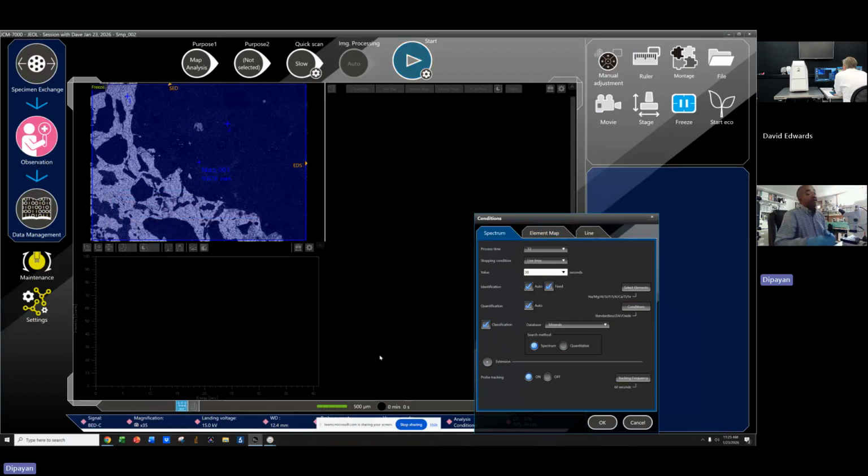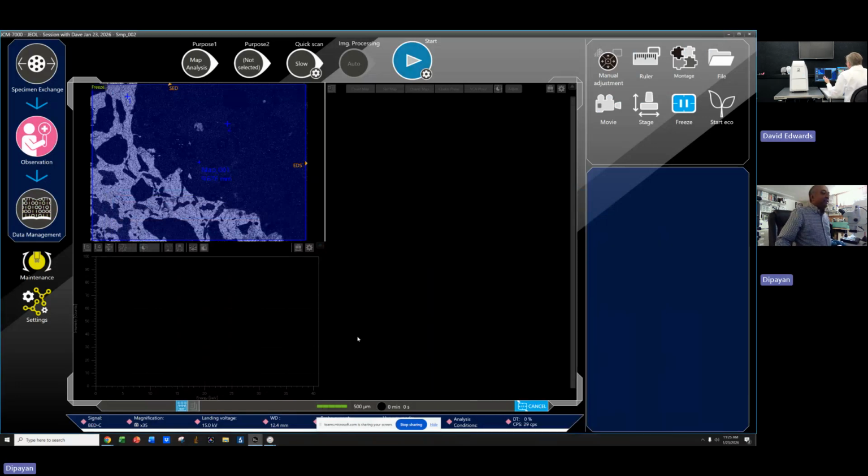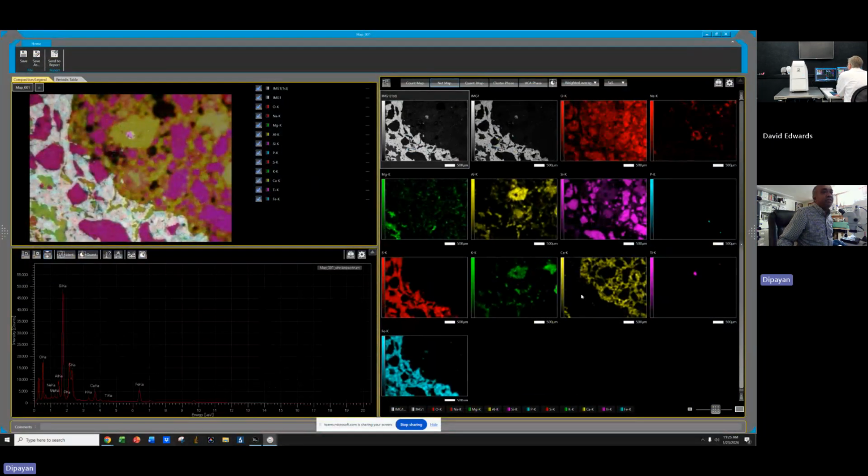I mean, it's not going to do that, Dave, because my paste will be so wildly different. My paste is a very heterogeneous composition. This paste is the most heterogeneous. That's the binder. That's the glue which is holding everything together. Of course. And that one changes dramatically depending on the environment the concrete is exposed to.